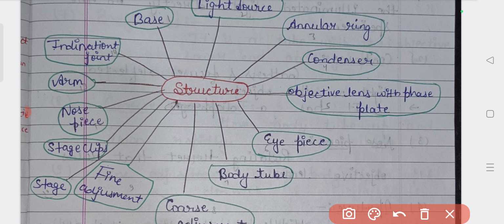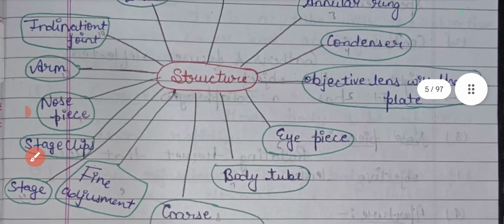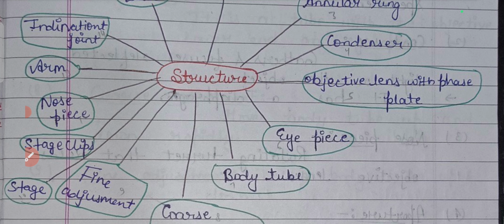So yeah, this is all about part 1 of the phase contrast microscope. As the phase contrast microscope is a bigger topic, we will be doing it in parts.